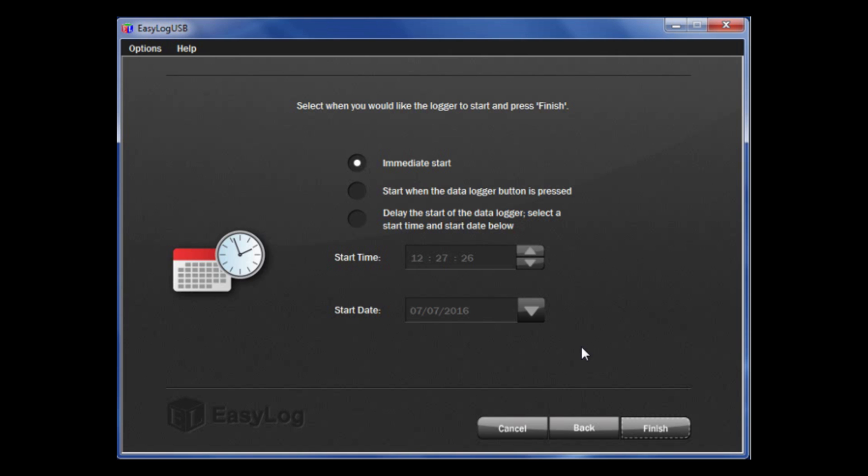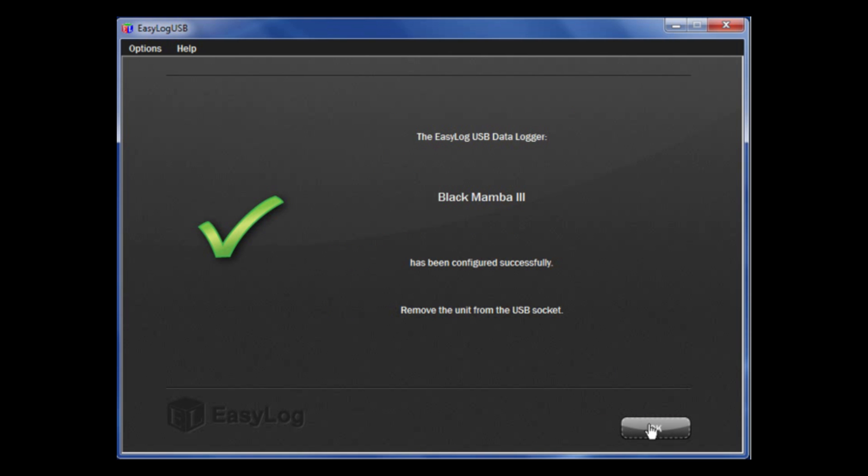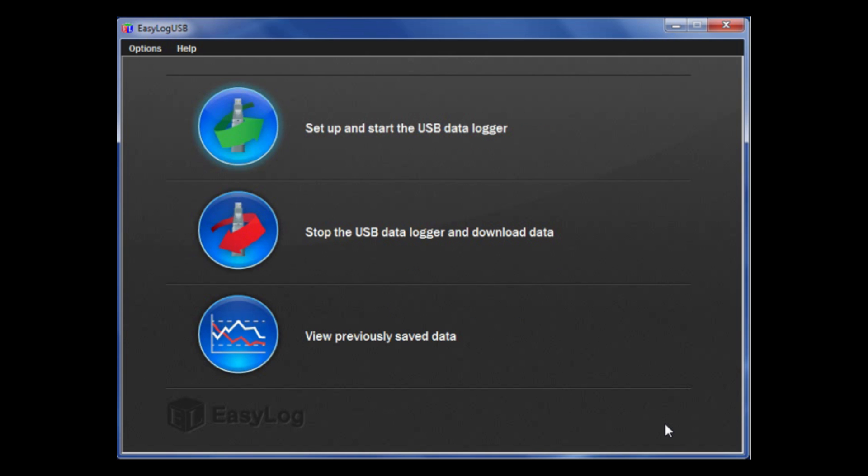Once that is complete, click Finish and your data logger is now complete. Simply click OK to exit. Now, you can take the data logger out of the USB port and place it in the desired location as it is ready to start taking data.